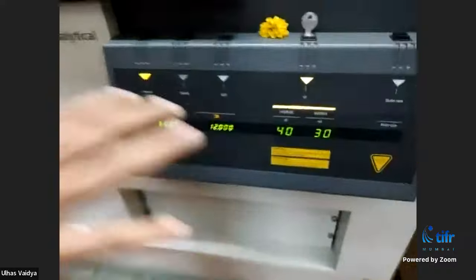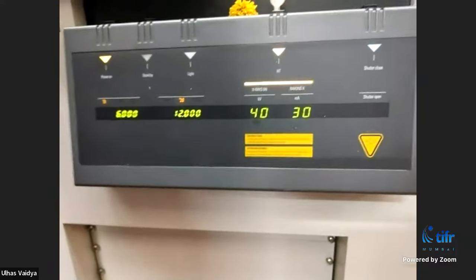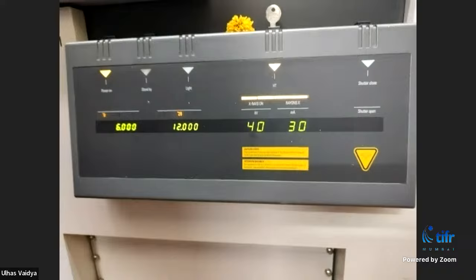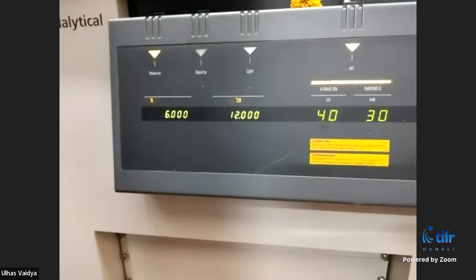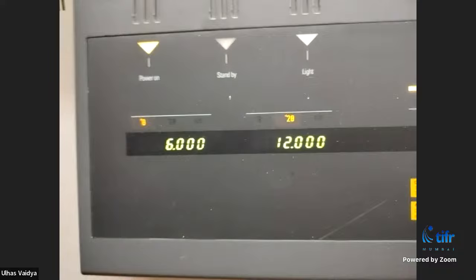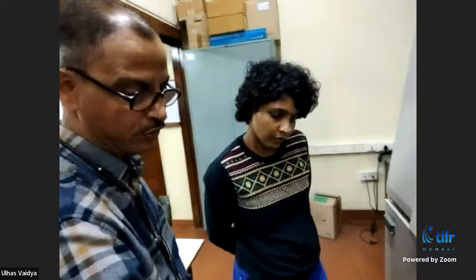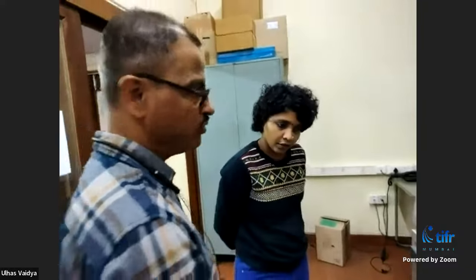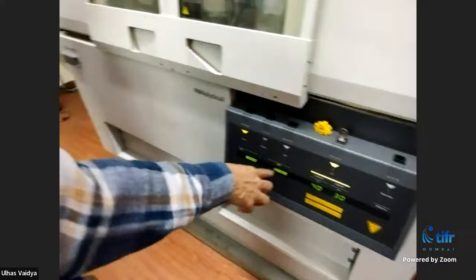The machine is enclosed so no radiation can come outside. On the display, three things are shown: the voltage at which electrons are accelerated, the filament current, and the angle theta — which is the angle made by the X-ray tube with respect to the sample surface. 2-theta is twice that angle, which is the detector angle with respect to the sample surface.